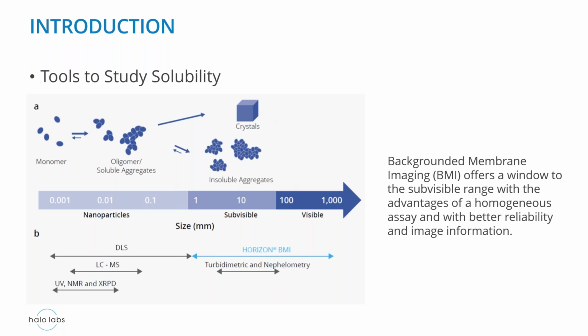So it is very nice in the visible, there's no problem, because if you have one of these chemical drug libraries, you just have to look at the plate and you can immediately see which ones are precipitated, which ones have crystallized. So just by eye, you can already see a lot of these compounds.